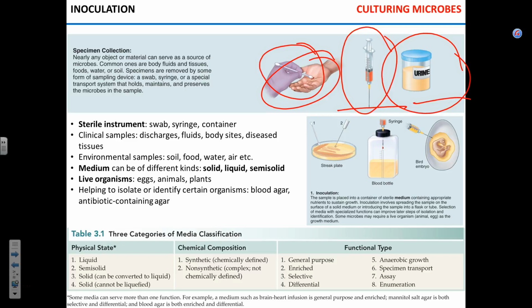Now, when you collect the sample, you have to grow those microbes. Now, if you put microbes here, technically speaking, will they grow? They probably won't. Why? Too dry, something else. No food source, no nutrients, and it's too dry, okay? When there's little or no food source, it is called an oligotrophic environment. Essentially, caves are oligotrophic environments. There's not a lot of food out there, okay?